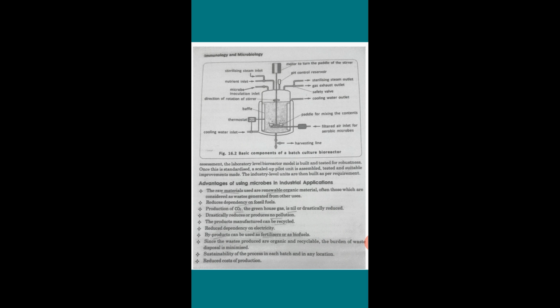This picture shows the diagrammatic representation of a bioreactor, where you can see the large vessel has got many layers. The outer layer is a covering in which coolant water has been filled. Through this, cooling water is pumped into the chamber, and through this vessel, cooling water will be pumped out.